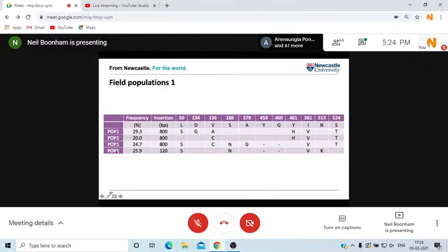And this is one population. These are field populations this time around. What we did here was run them through the system and see what we could see. This is the isolates that we saw in population one. We found four isolates. The proportions are all about the same. And these are the mutations that they carry, so different insertions within the promoter region and a range of different mutations. So this was a field population that was predominantly made up of four different isolates.